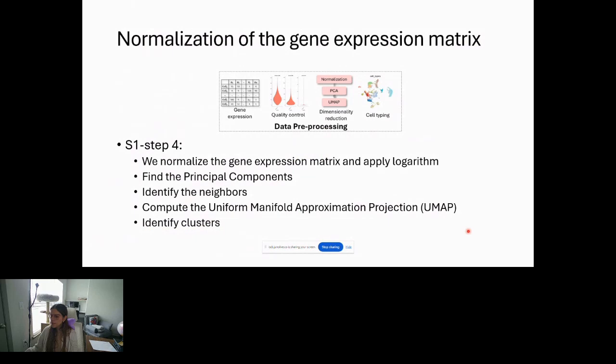So in this case, we can think in the spatial transcriptomics, once we do the cell segmentation, we can look at the data as if it was a single cell data set. In a single cell data set, we can visualize a matrix where the rows are cells 1 to n, and the columns are the count of the transcript for every gene. We have as many columns as genes. In this data set, we have about 1,000 different genes. And each entry in this matrix is an integer that tells us the number of transcripts per gene for each cell.